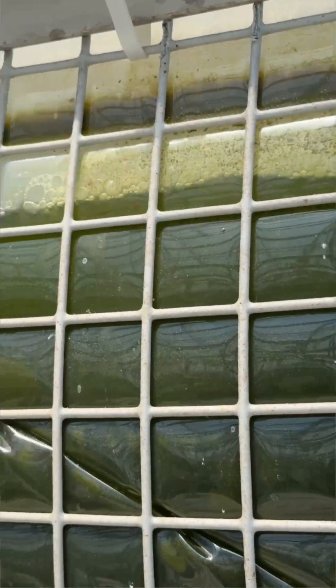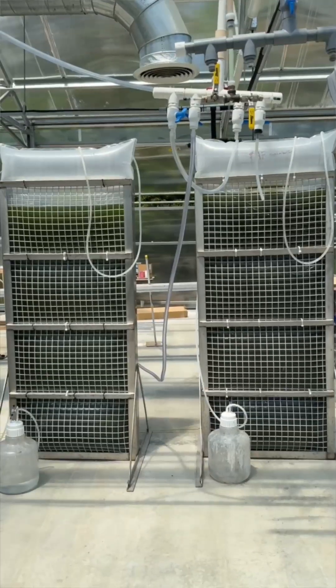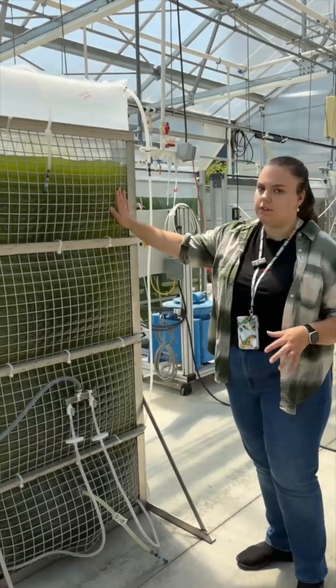Our algae is going to be used to provide educational kits for teachers. We're going to be doing a harvest with two different bioreactors full of nanochloropsis.